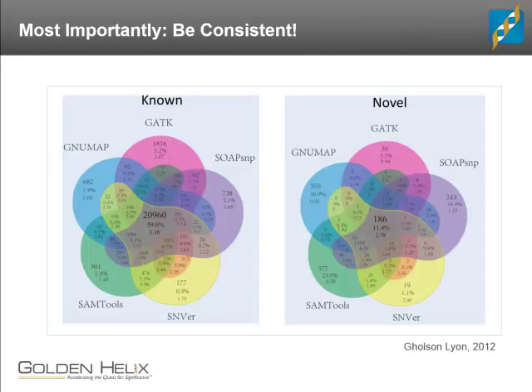This slide is a couple years old, but I think it still holds up pretty well. What happens with rare variants is that when you really think about the variant calling process, the rarest variants are also the most likely to be incorrectly called. If a variant is called that is something that is very common in your population, it's a pretty good chance it's really there. If it's something that's never been seen anywhere before, then it's something that you might need to be a little more concerned about.